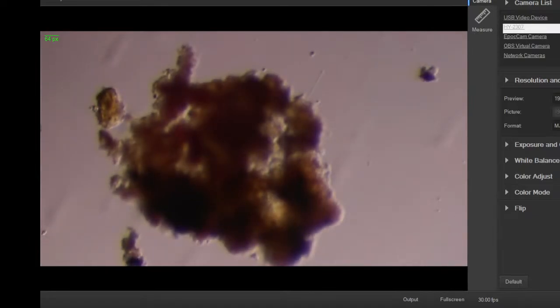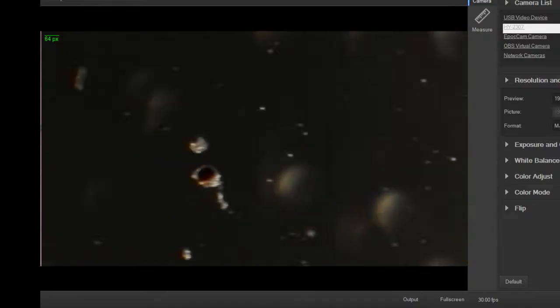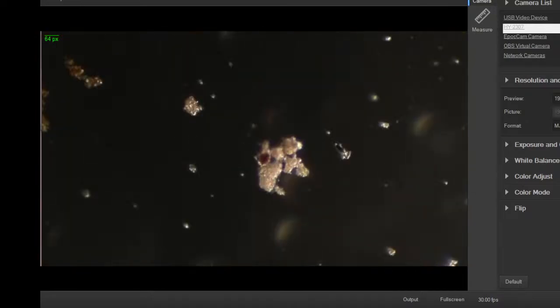Spots. It's got a lower power. Still got plenty of life on the cell before it starts to dry. Switch back to dark field. There's some drama. And it's really good for seeing the particles too. Yeah, they all took off from that spot. Found some new hunting grounds.